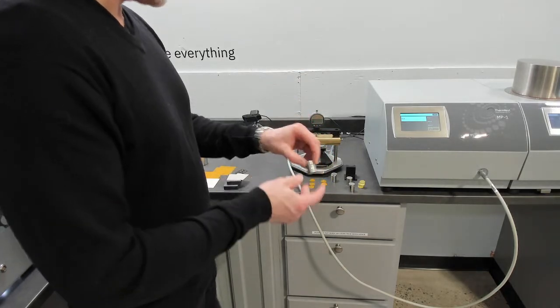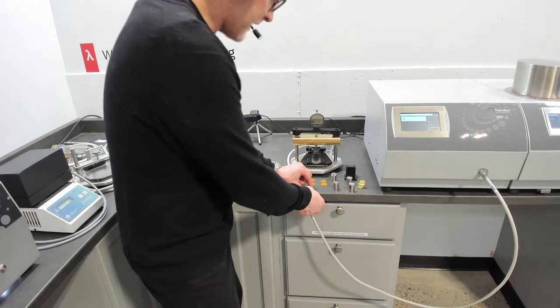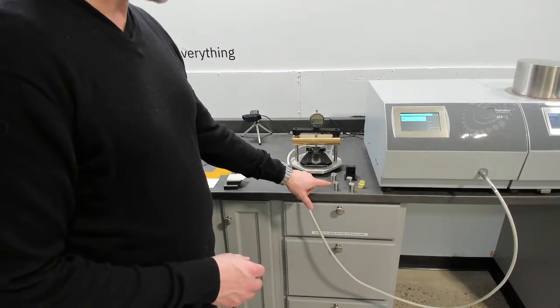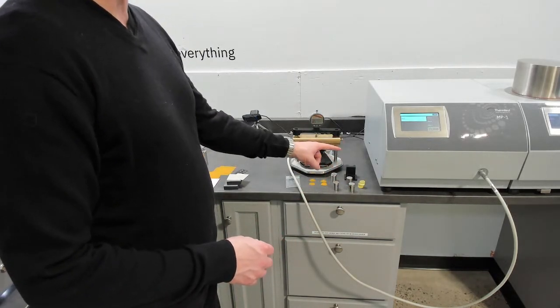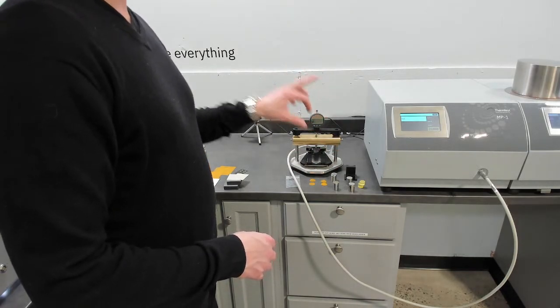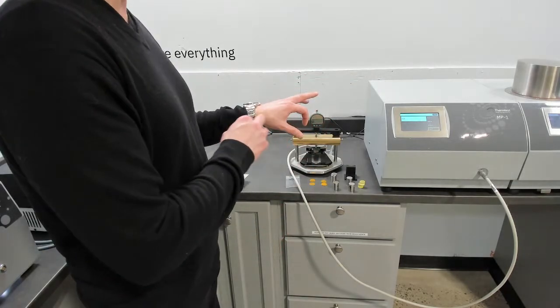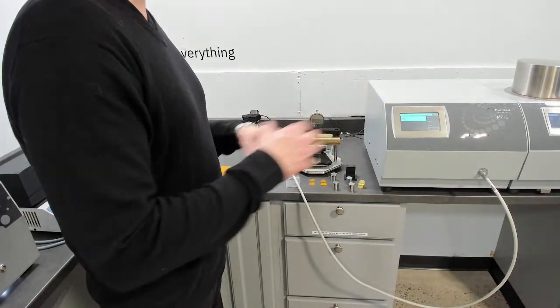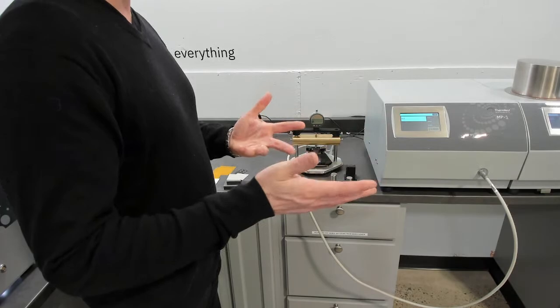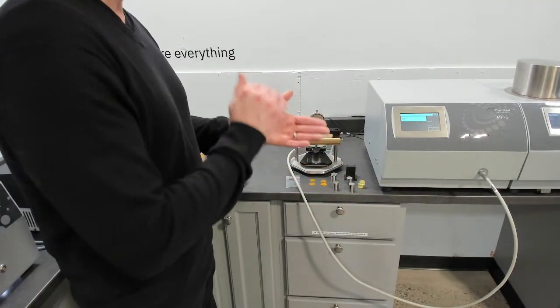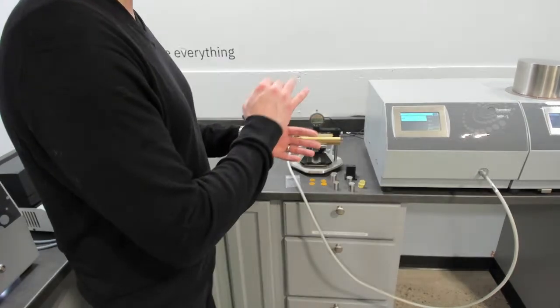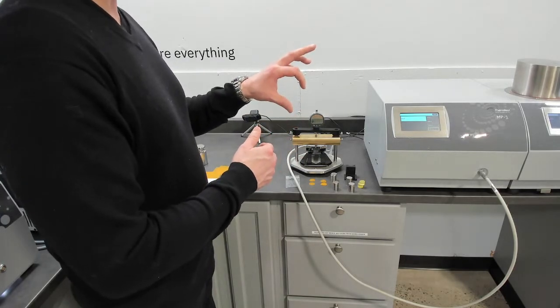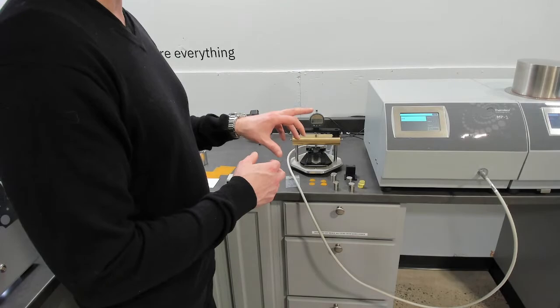So why is this different? Well, when we introduce one layer of Kapton, that gives us a resistance of one layer of Kapton, that configuration. And then we repeat that process with two layers and three layers, and we get a change in resistance with change in thickness. That approach of multi-layer to back out the contact resistance between the layers is quite common. That has been around for a long time. And in fact, the ASTM E1530 has a multi-layer approach for that standard, which measures resistance for backing out the contact resistance between each layer. So what we get is a relationship of change in thickness and change in resistance, the inverse of that slope. So one over that slope is the thermal conductivity.